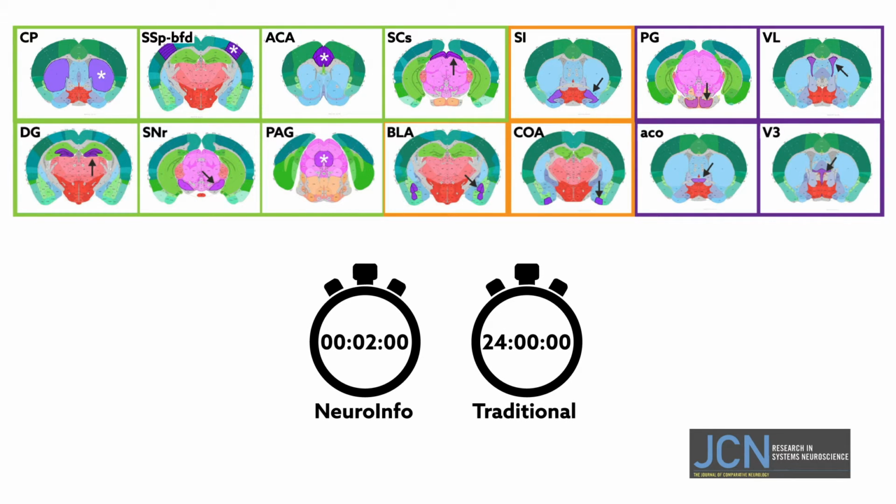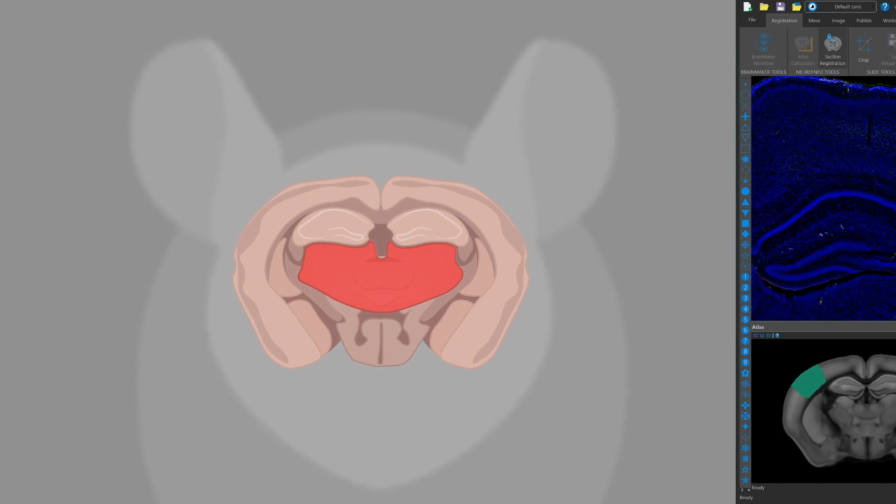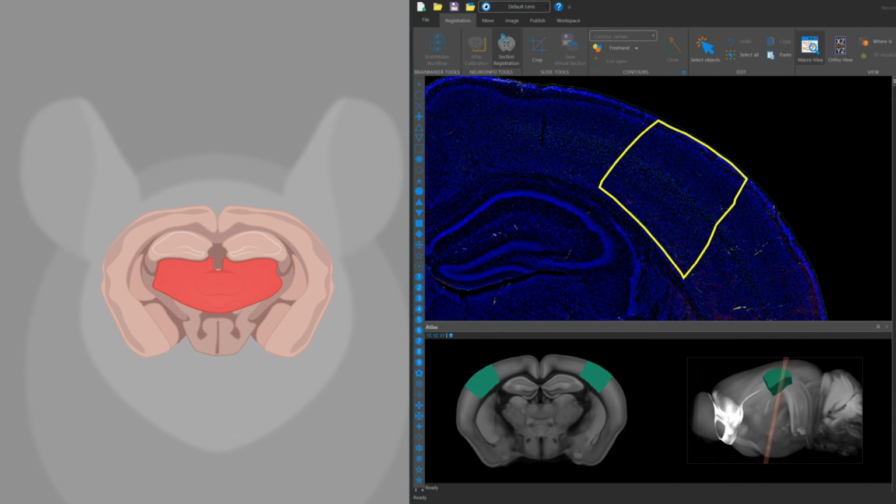Areas located in the midbrain or those lacking nerve cells were more difficult to define, but it does appear that the approach has the power to fundamentally change how researchers who investigate the mouse brain integrate and compare information from multiple experiments.